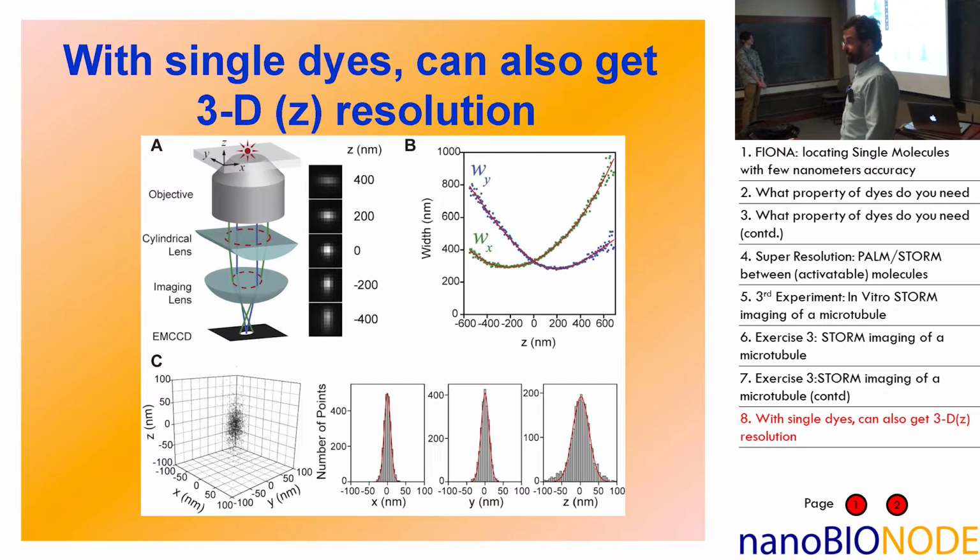It's sort of amazing. So you've done this for one point, now you've got an x, y, and z, and then you do it for another point. Again, you have to be careful, because you only want to excite a single one here, and then a single one here, and then a single one here. So it can take quite a while.